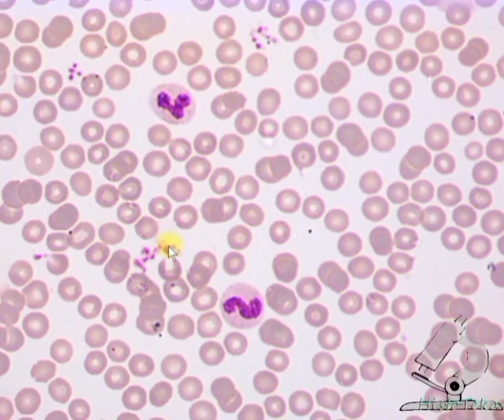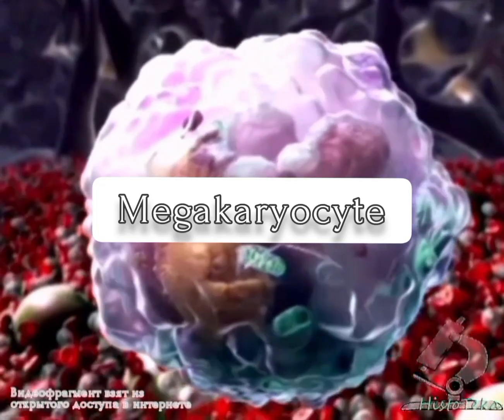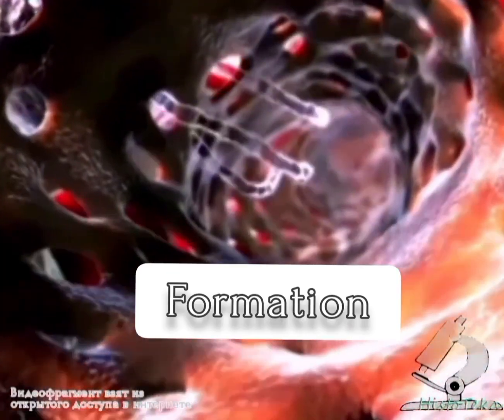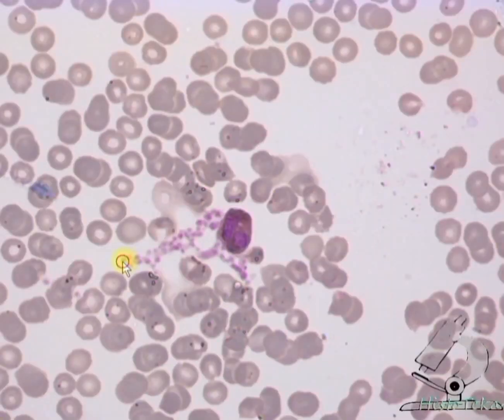The next type of formed blood elements are platelets. Platelets are nuclear-free fragments of the cytoplasm and plasma membrane of megakaryocytes, huge cells of the red bone marrow. That is, they are not cells, but post-cellular structures. Also, they are called thrombocytes. Platelet size is 1.5 to 2 micrometers. They are significantly smaller than red blood cells.